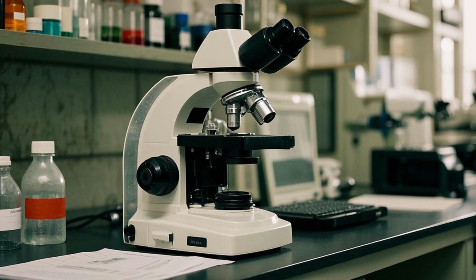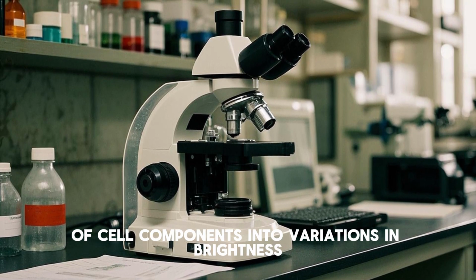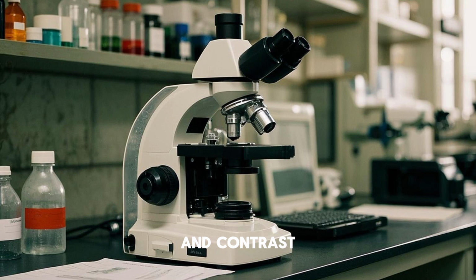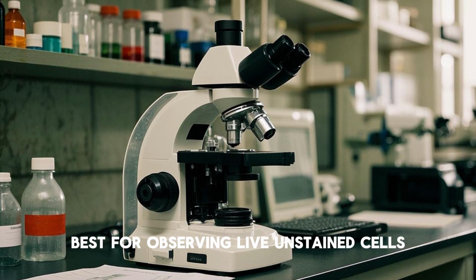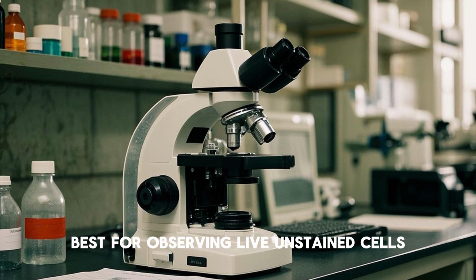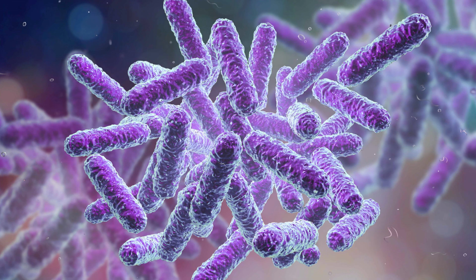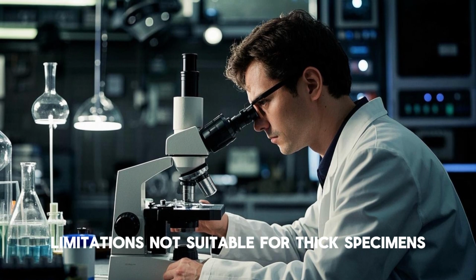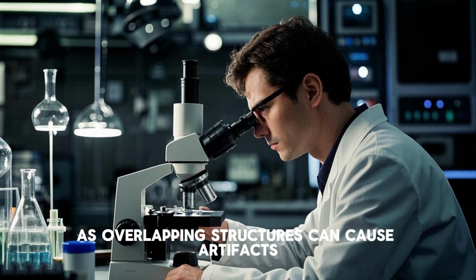Principle: converts differences in refractive index of cell components into variations in brightness and contrast, allowing visualization of transparent specimens. Best for observing live, unstained cells, including motility and internal structures like organelles. Limitations: not suitable for thick specimens, as overlapping structures can cause artifacts.